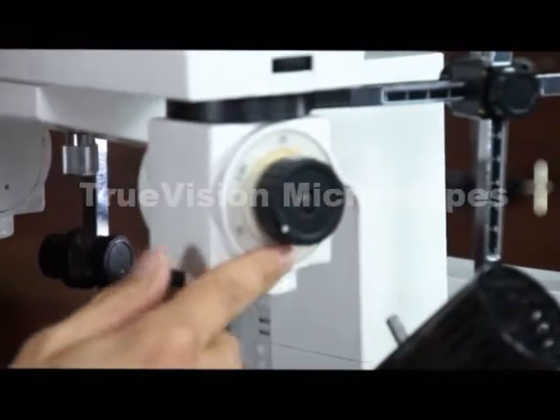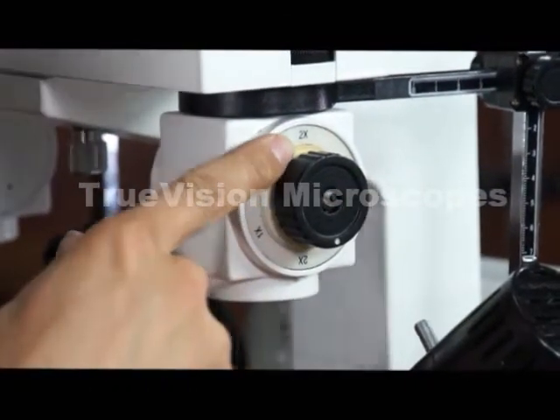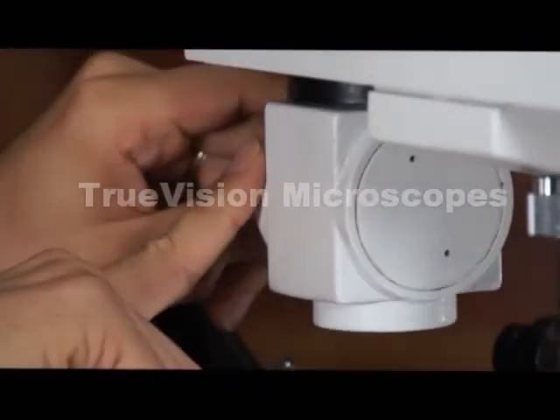These are the objectives. You have to make sure that whatever power objective you're using on one side matches the same power objective on the other.